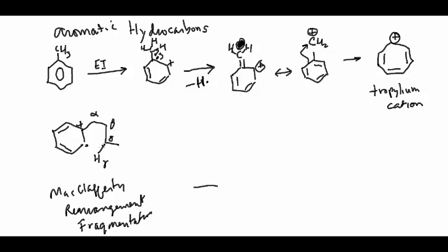And it works like this. The CH bond here is going to break homolytically. A hydrogen atom breaks off, and it's going to bond to this carbon. A donation of an electron from that carbon occurs here, and you're now making a covalent bond there. The remaining electron of this bond moves over to that bond.